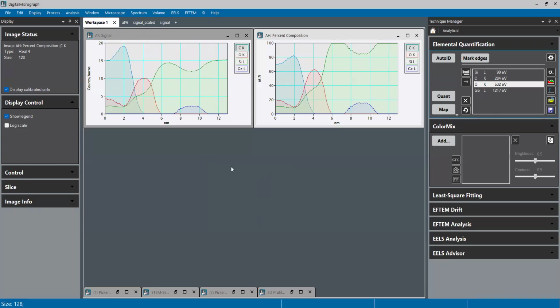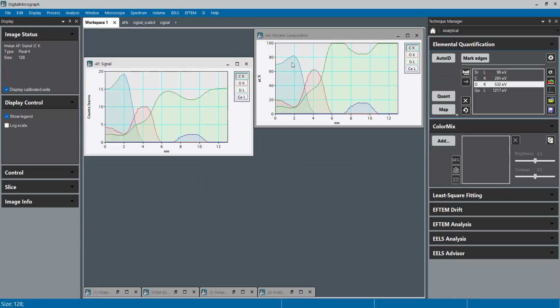So we'll go ahead and get that. The ones that scale by cross section are far more useful here. Again, these are the precursor to atomic percent. In an atomic percent, the sum of the parts has to equal 100, so basically that's what it's doing. It's very similar, I believe, to the quant for EDS once you have the signal scaled by cross-section, but there might be additional nuance on that. I'm a little less familiar with quantitative EDS.